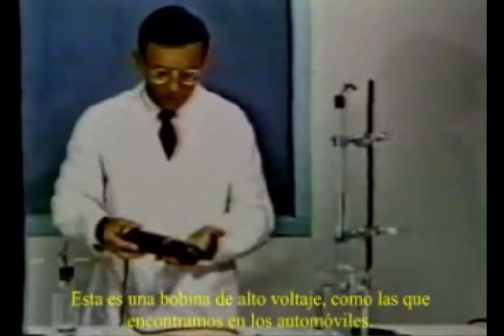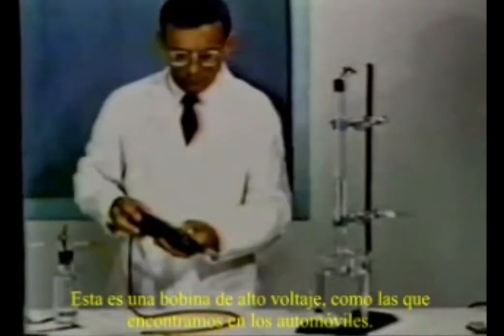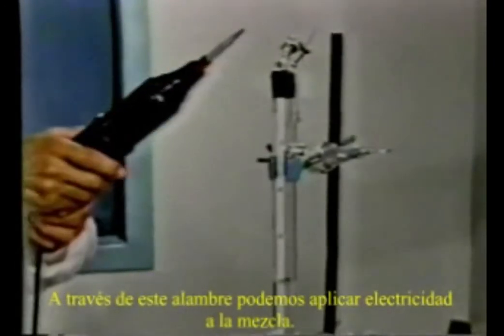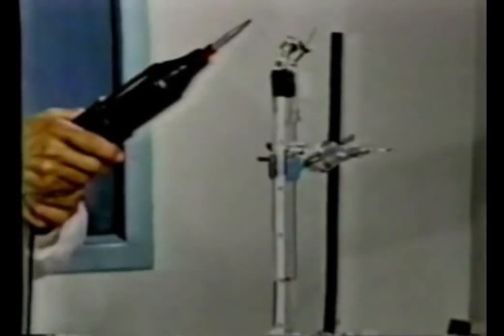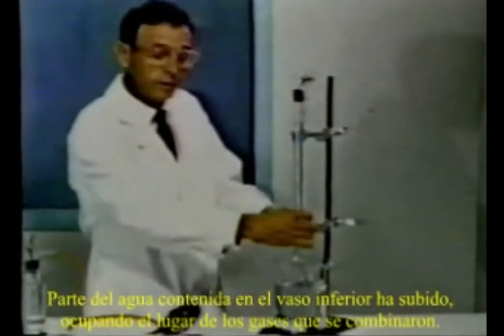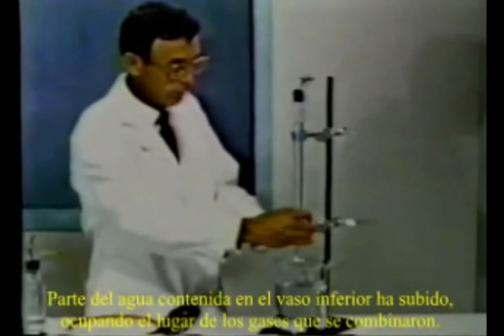This is a high voltage coil, not unlike that used in an automobile to generate the spark. By this wire at the top, we can spark the mixture. The scale reading is 4.9. After that spectacular reaction, some gas remains. Water from the beaker has risen in the tube, taking the place of gases consumed during the explosion.